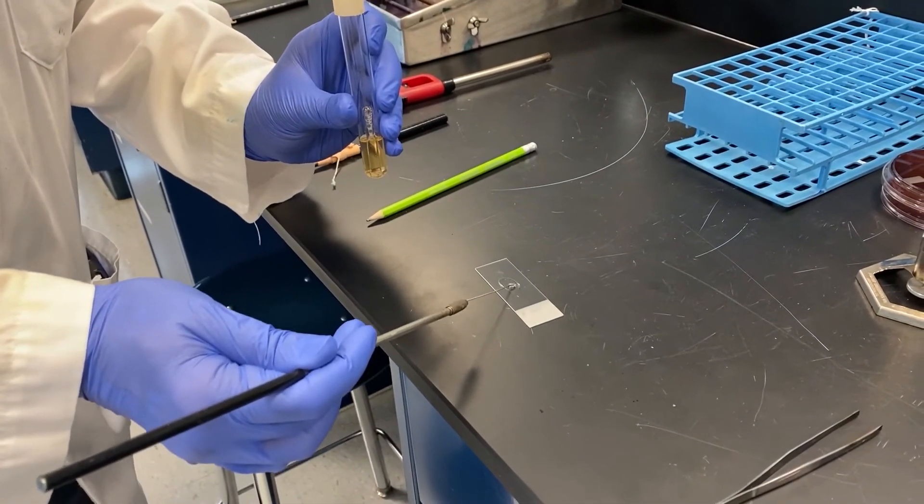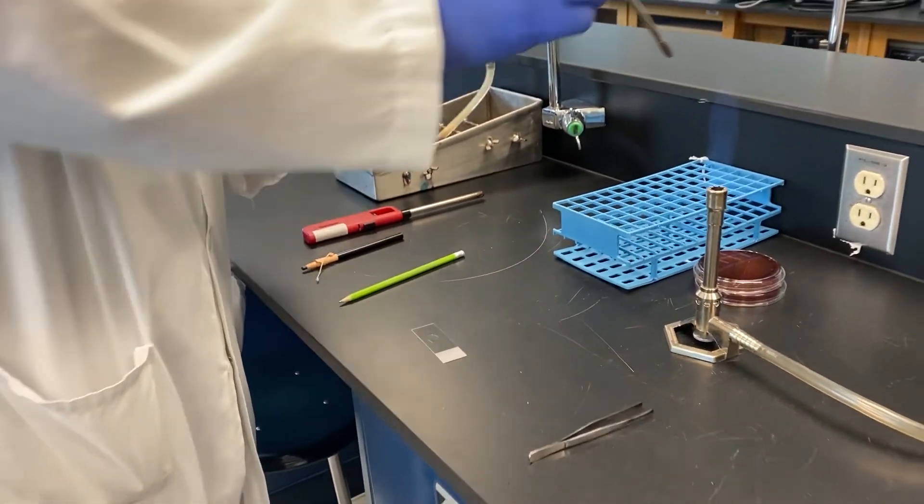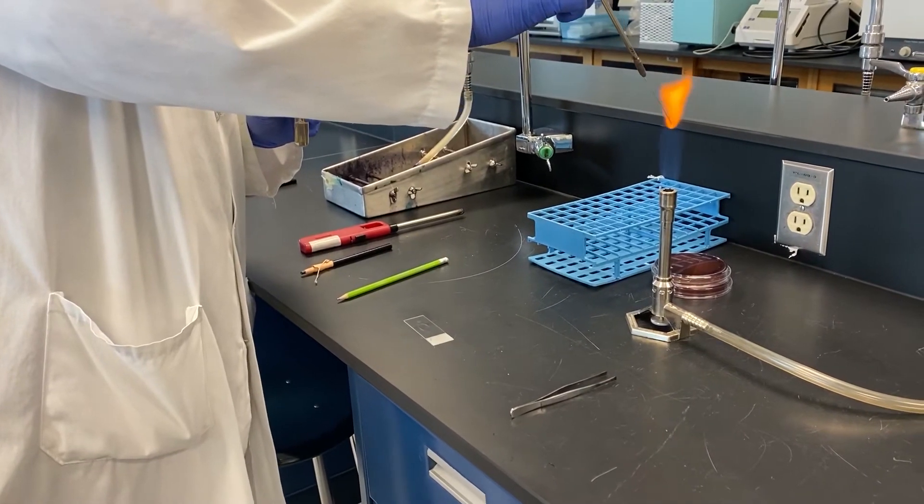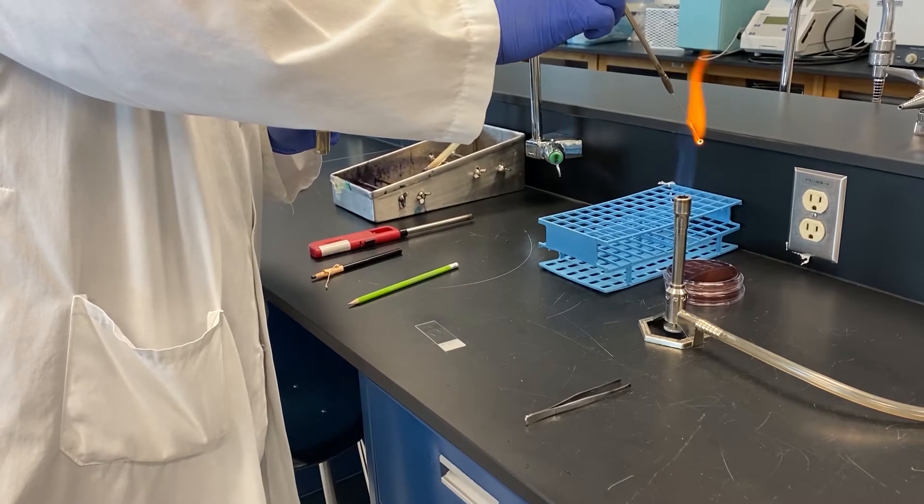Here you can see the culture being applied to the middle of the wax circle on the slide. Coordinating the sterilization of the loop, removal of the culture cap, and flaming the mouth of the tube will feel awkward at first. But with a little practice you will get used to it.